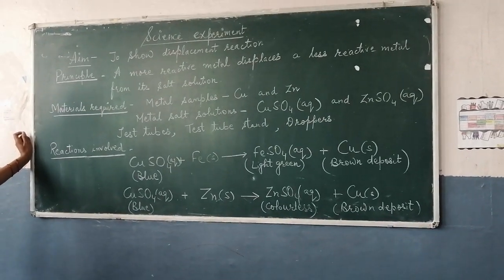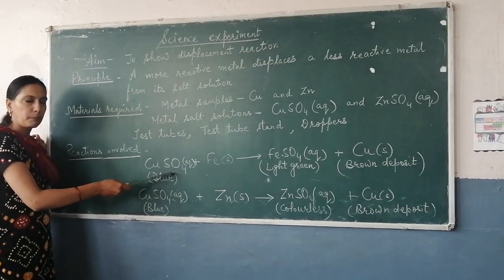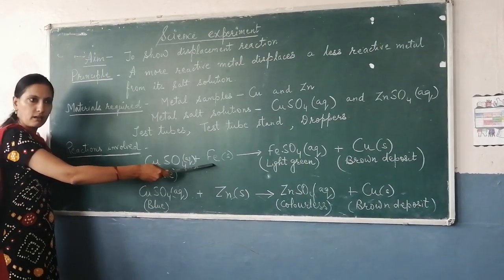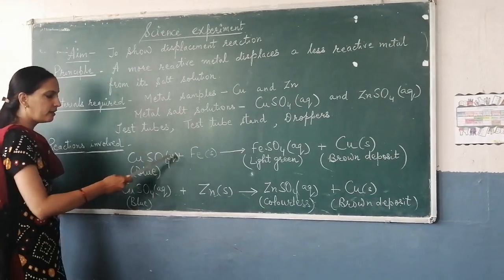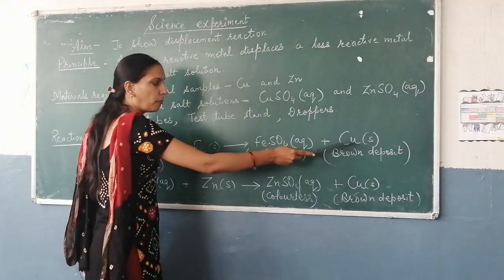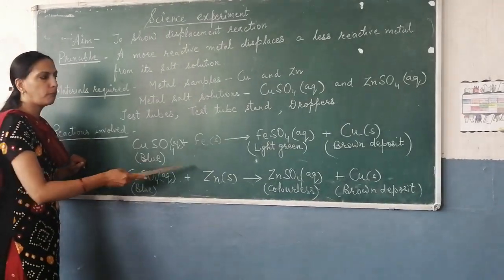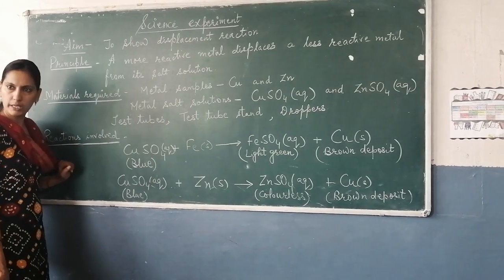We will do two displacement reactions here. First, we will take copper sulfate solution plus some iron nails. We will see that iron displaces copper from there, and copper is separated from the iron sulfate solution. We will see that the color will change from blue to light green.